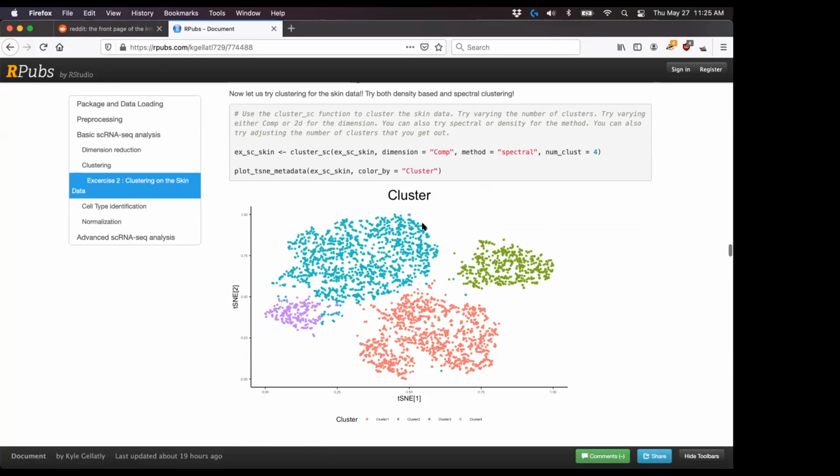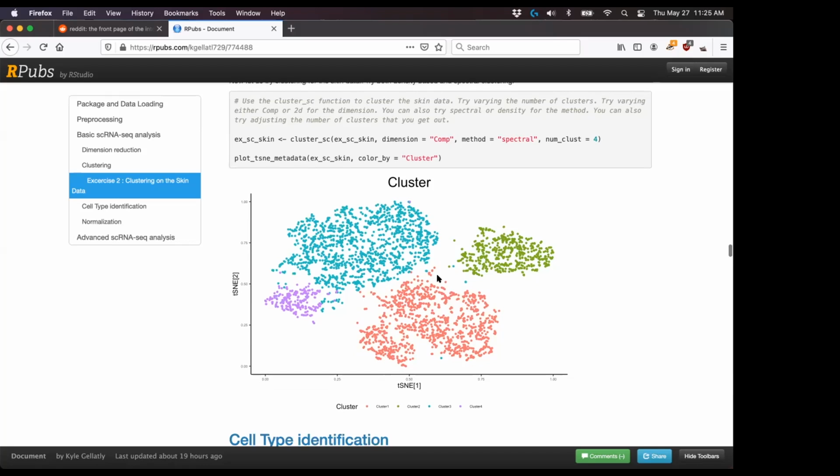There's going to be a set of genes that differ between those two. When we compare a CD4 to a CD8, they're relatively similar, compared to how similar a T cell is to a dendritic cell. For that reason, we're not separating out well the subsets of T cells, the CD4s, the CD8s, and the gamma delta T cells.